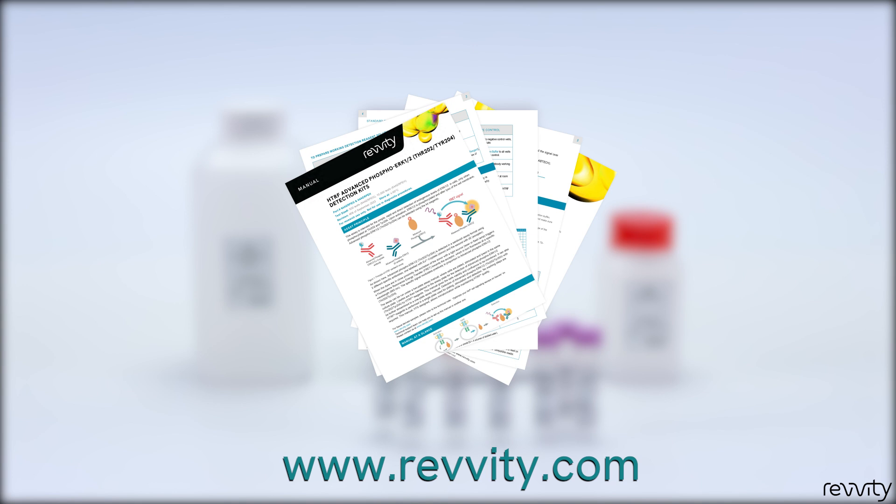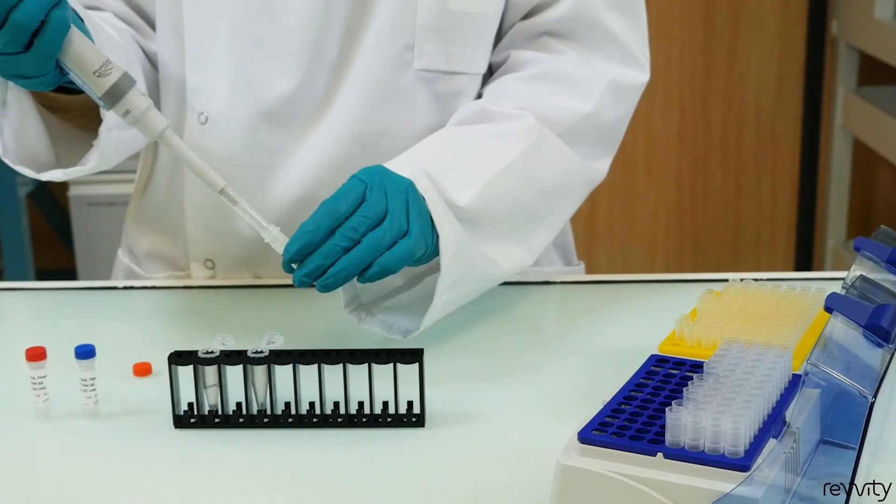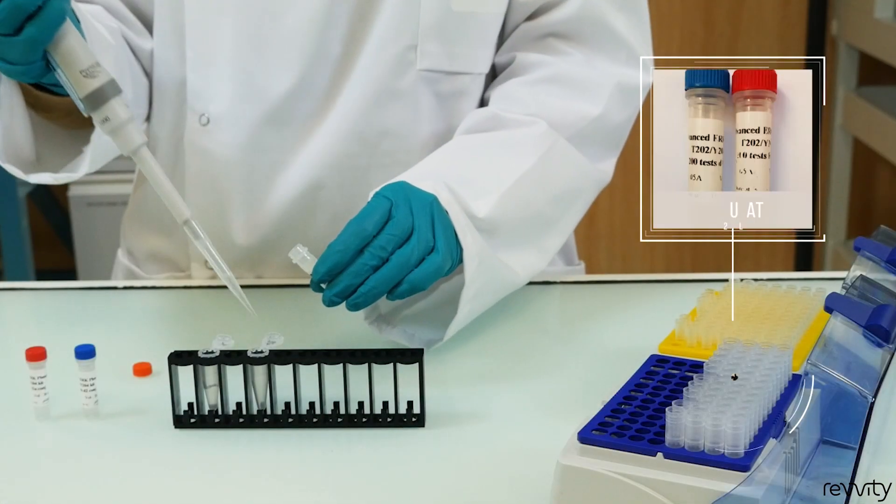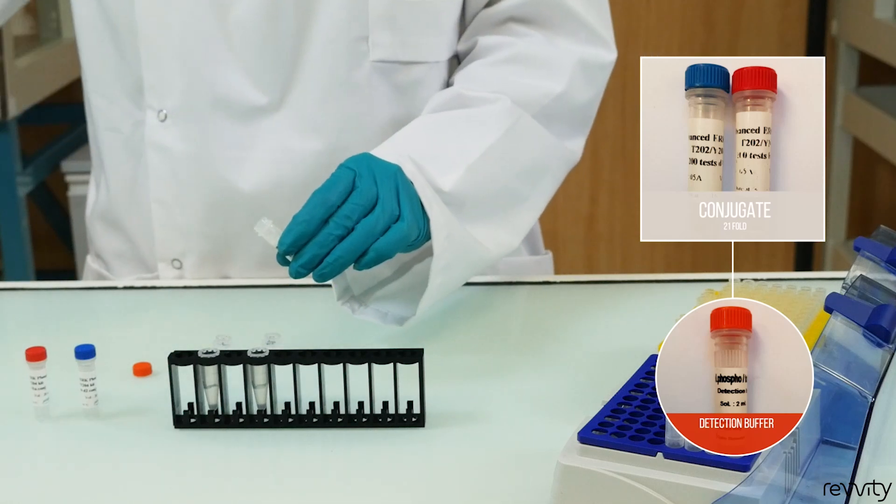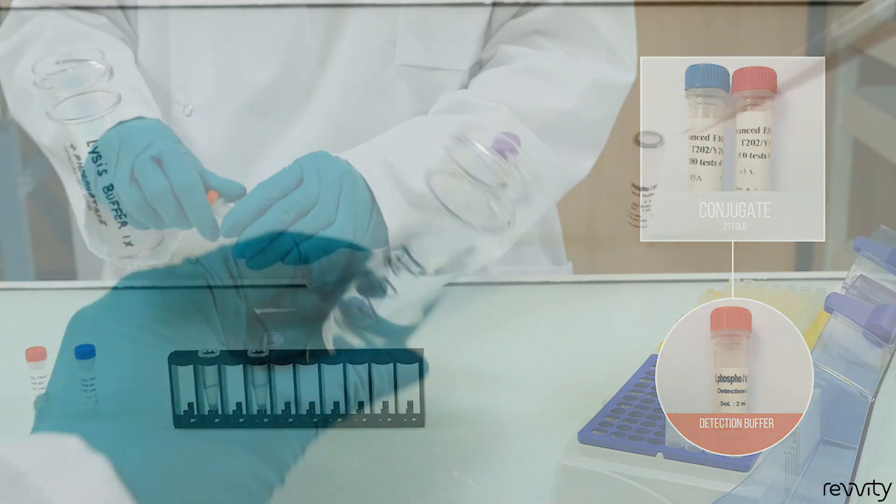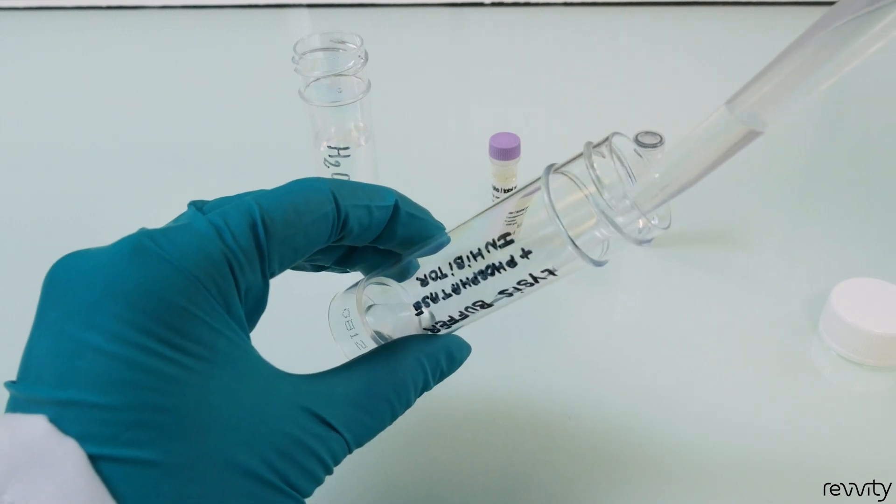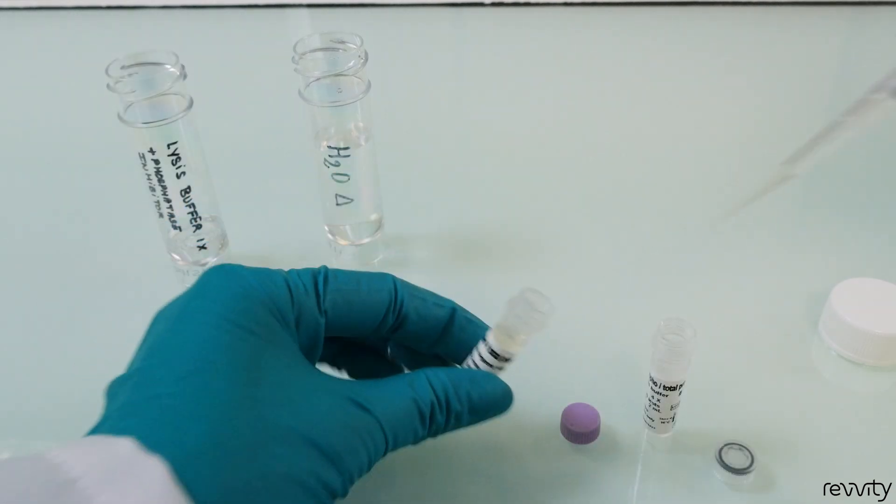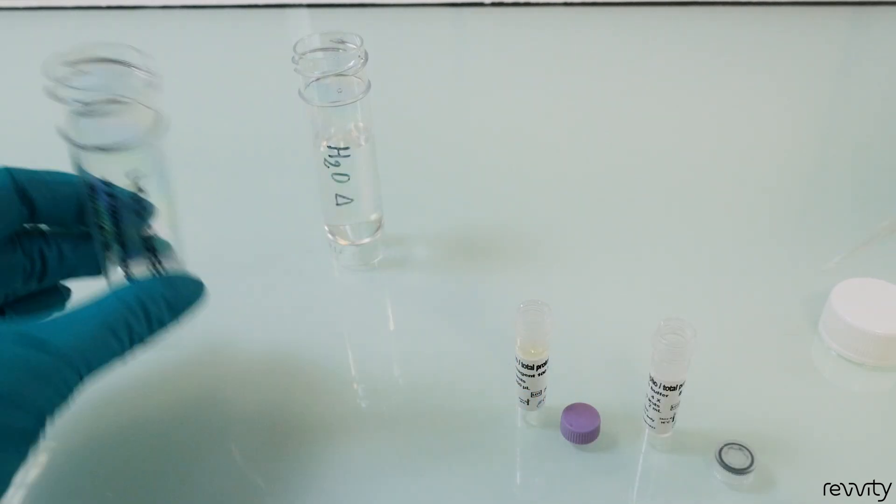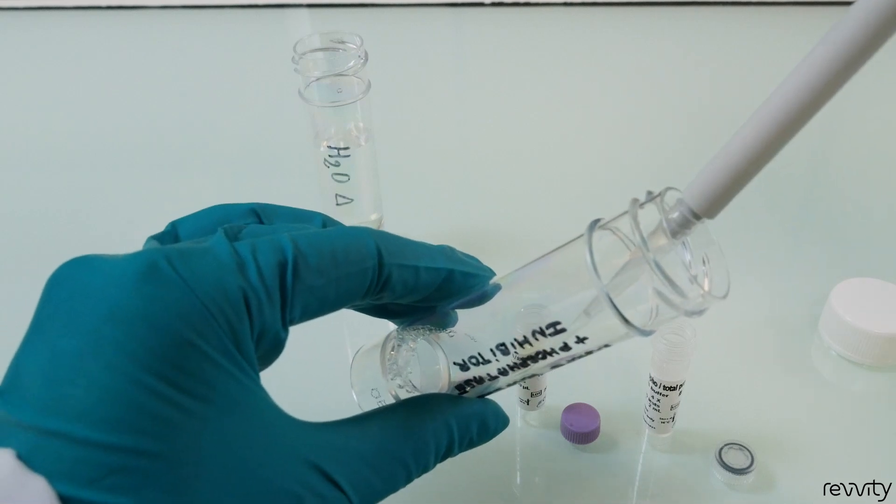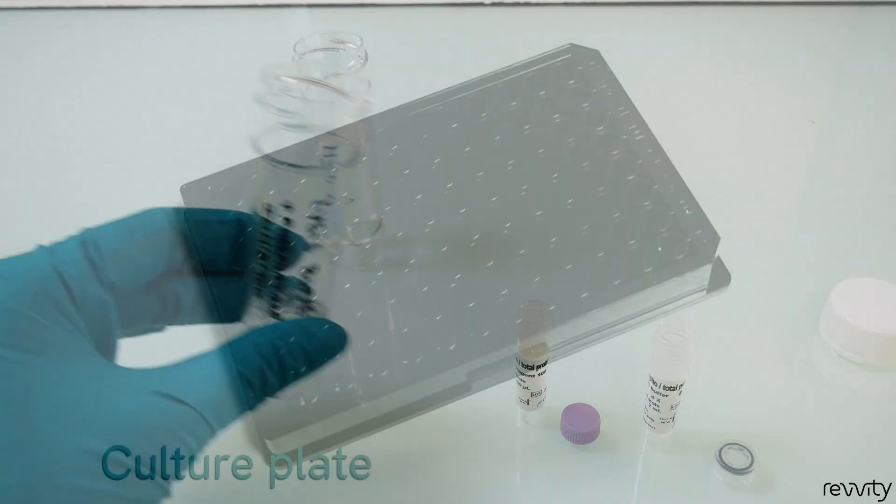Now let's look at the experiment step by step. First, reconstitute your conjugates just by diluting 21-fold the stock solution in the detection buffer provided in the kit. Prepare the 1X lysis buffer by diluting the 4X stock buffer in distilled water, then supplement it with phosphatase inhibitor. That's it! All reagents are ready to get your assay started.